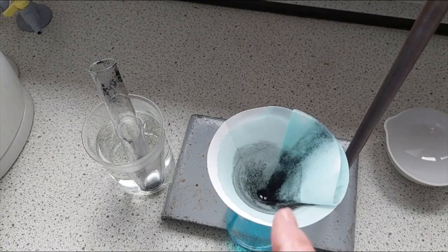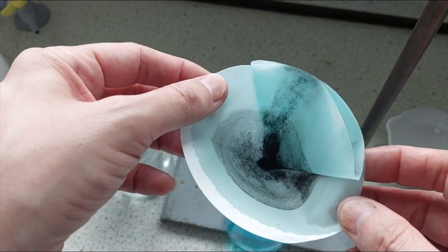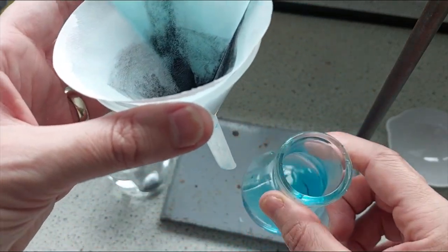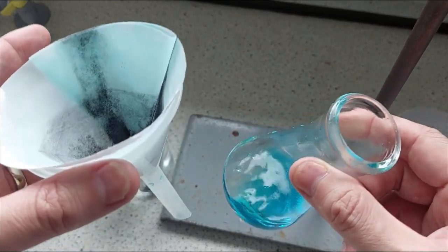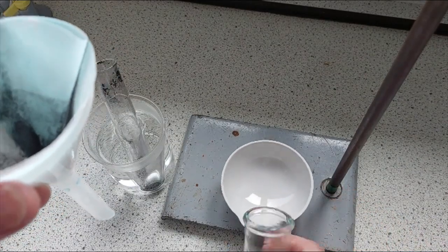Now then, I've left that long enough, and as you can see inside the filter paper, we've got this black powder, the copper oxide powder. We call that the residue. The residue is what's left over in the filter paper. Through the funnel, we have filtered out the filtrate. The filtrate is the liquid that passes through the filter paper. So this lovely blue liquid now, what we're going to do is pour it into the evaporating basin.